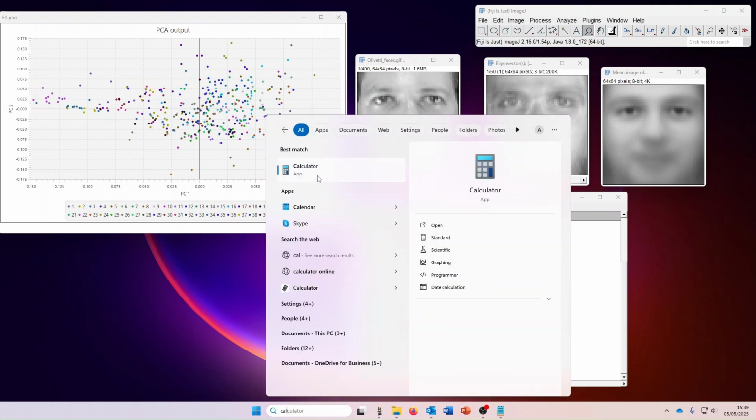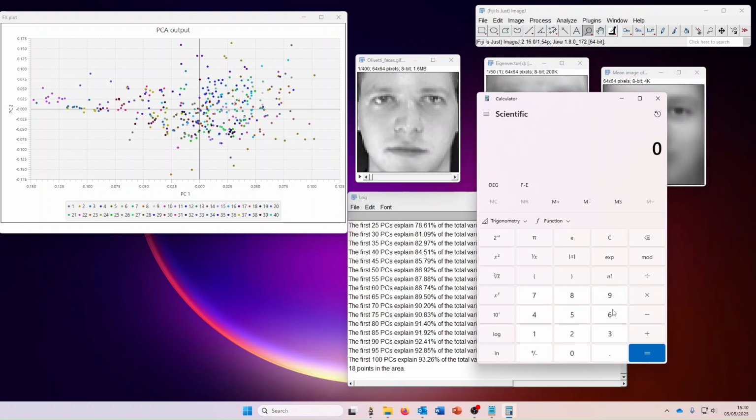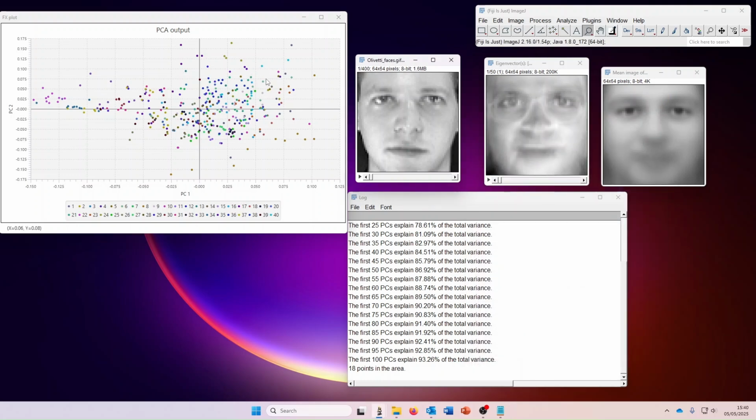This is probably not strictly necessary to show you right now, but we could pick something like 64 times 64, which is the total number of pixels in this image, and then divide that by 2, and pick somewhere in that range, right? So let's pick 2000, or 2020, or 2048. So we can recolor this by input variable and pick 2025, say, somewhere in the middle. And you can see that now it's recolored them by whatever variable is there.